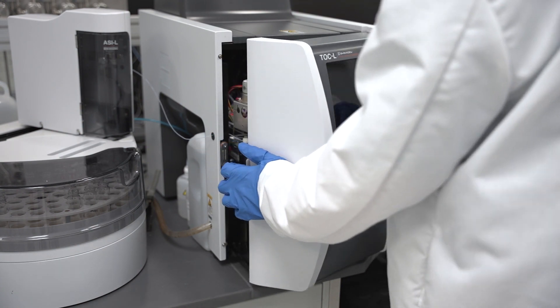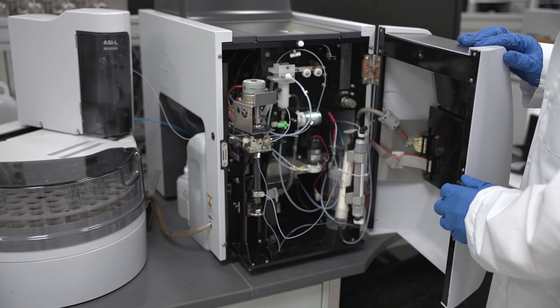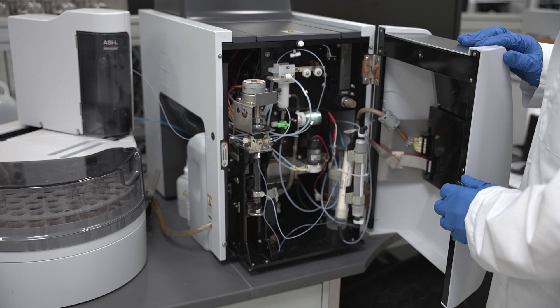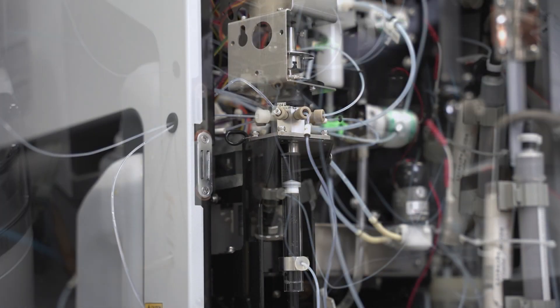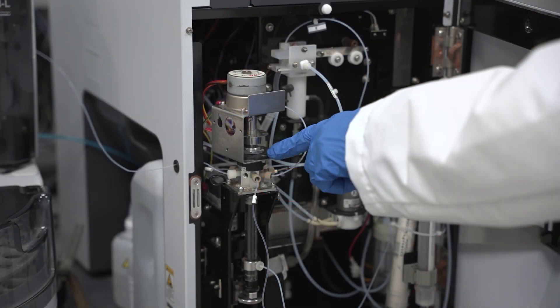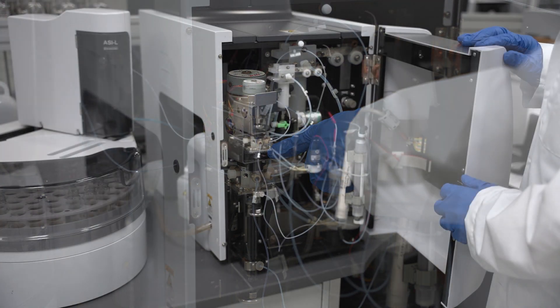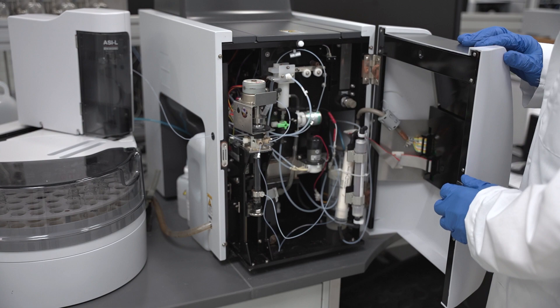Part of the routine maintenance on the TOC-L involves replacing the syringe plunger tip and 8-port valve rotor. The plunger tip is the white Teflon part located here in the syringe and the rotor is inside the valve above the syringe. These parts play a crucial role in sampling and delivering precise injection volumes to the instrument for measurement and need to be replaced periodically to keep the instrument working properly. The frequency at which these are replaced will depend on the sample matrix and the frequency at which the instrument is used.